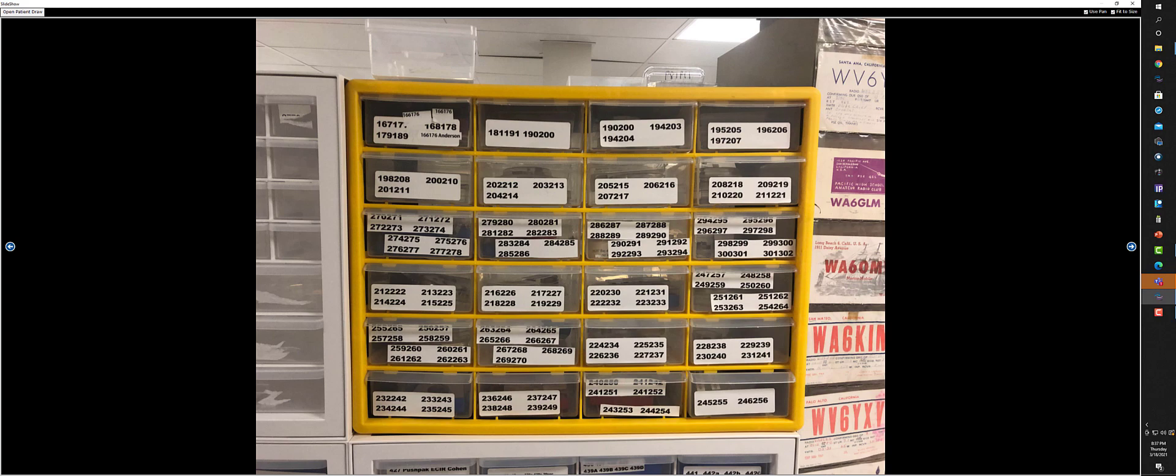That's pretty much how you go about doing a TEM specimen prep. I don't know if it's of interest to you, but if it is, I wanted you to have some idea of what's involved in doing this.